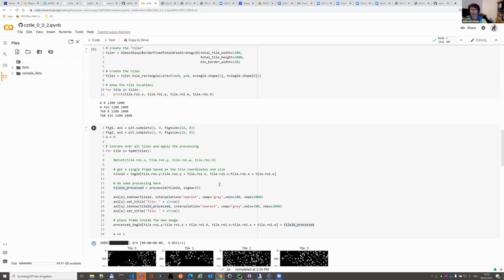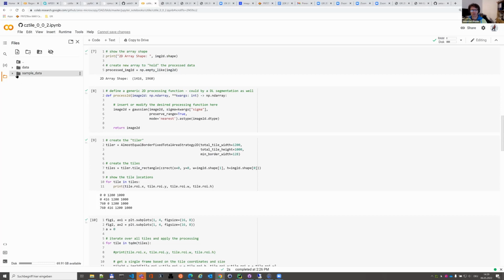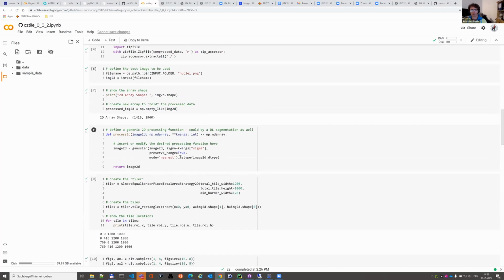Okay. Yeah, also here, sample data are there. Feel free to use it. And give me feedback on how this can be improved or maybe adapted. And I would be really interested to learn if one or the other of you will actually use it at some point. It's not rocket science, but it works, in my opinion, quite nicely and saves you some time.